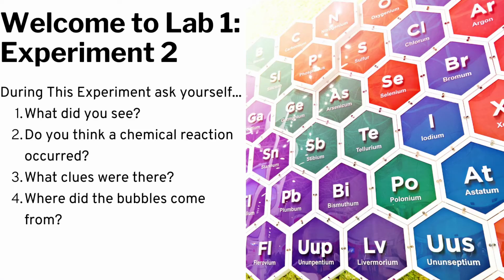Welcome to Lab 1 Experiment 2. During this experiment, ask yourself: 1. What did you see? 2. Do you think a chemical reaction occurred? 3. What clues were there? And 4. Where did the bubbles come from?